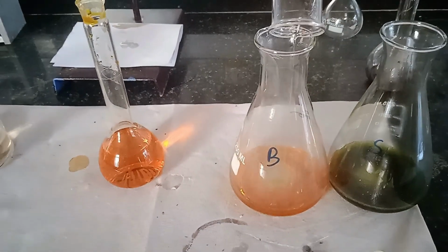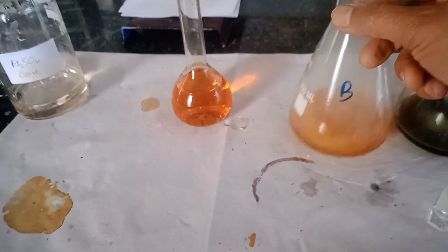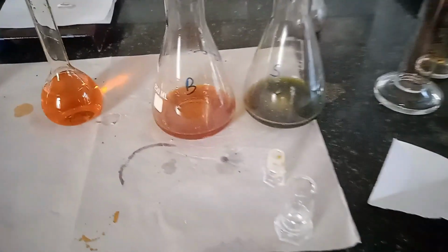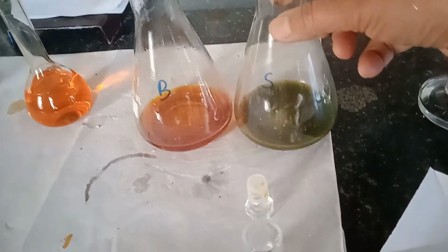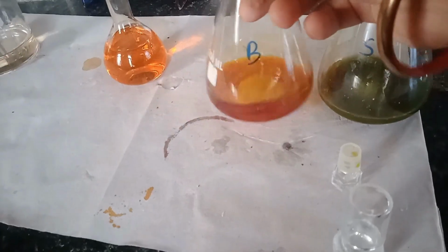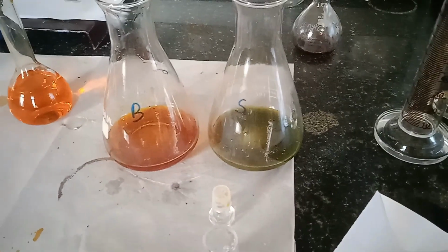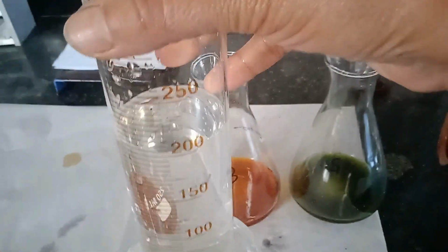Here you can see there is no sample in the blank, so it reacts with the potassium dichromate, and you can see the color change in both the sample as well as the blank. In the blank there is no reaction, so no chromate is changed to chromium 3, however in the sample it changes to chromium 3, so we have a greenish color.